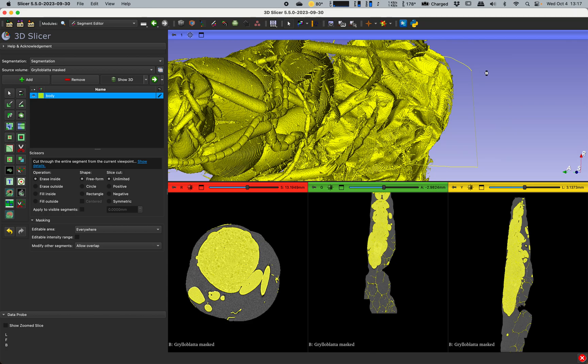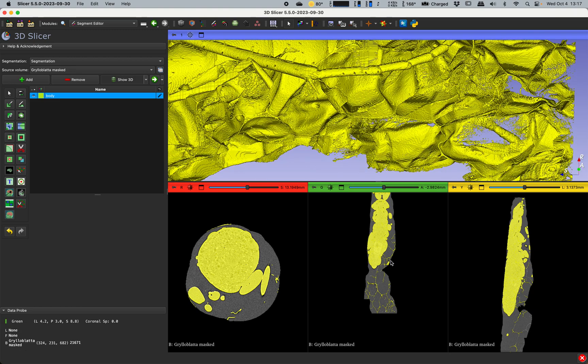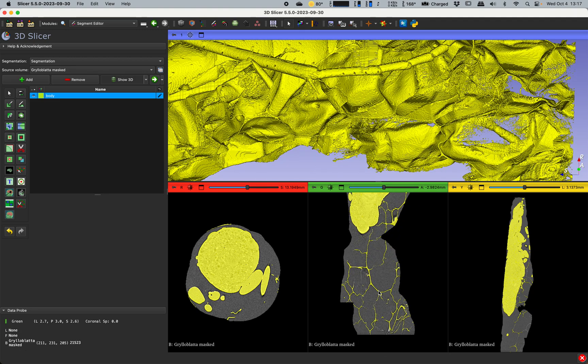Now another way to do it, as I've said there's almost always more than one way to do things in Slicer, is you can go through here and use the erase tool.